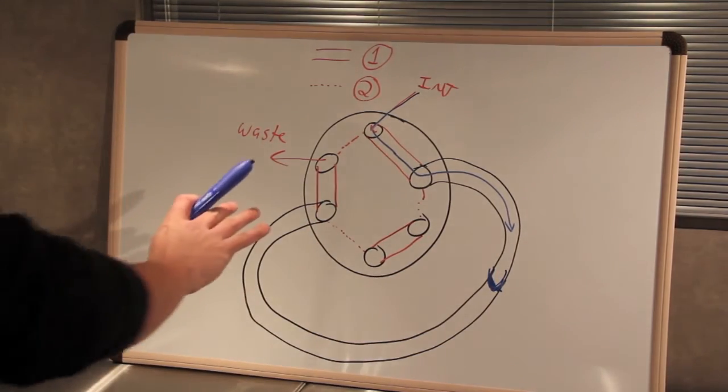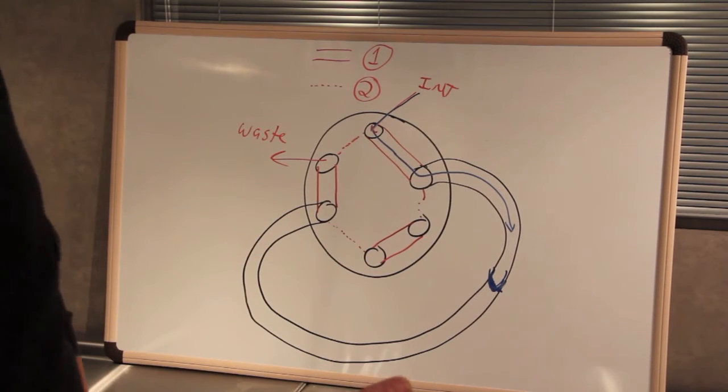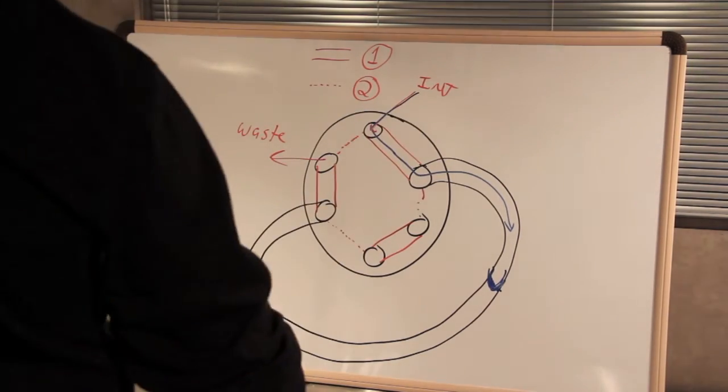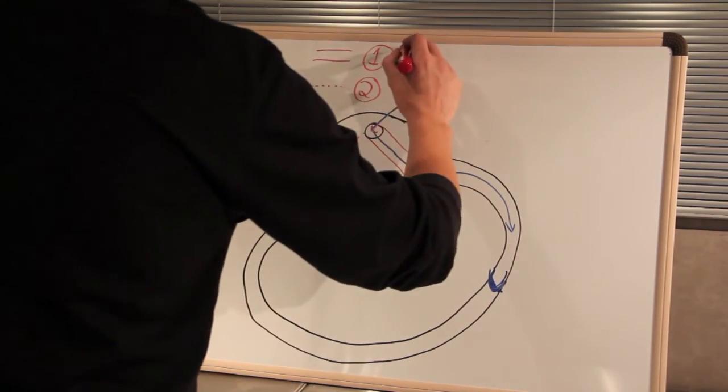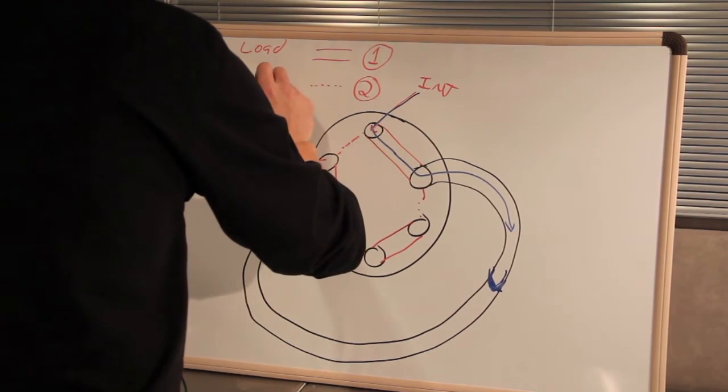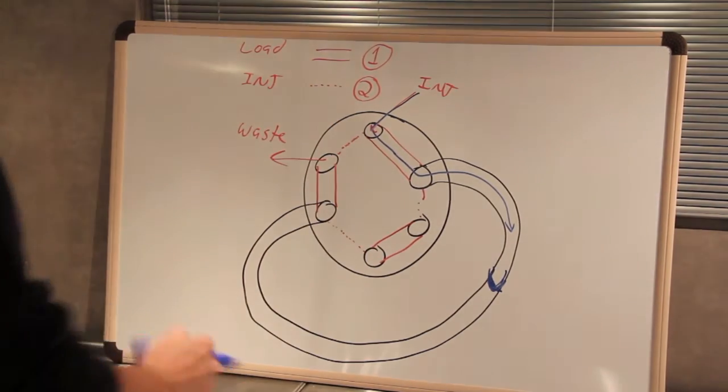When we switch this to the inject position or to inject it onto the column... So this would actually be the load position right here. Position one will be load and position two will inject it onto the column.